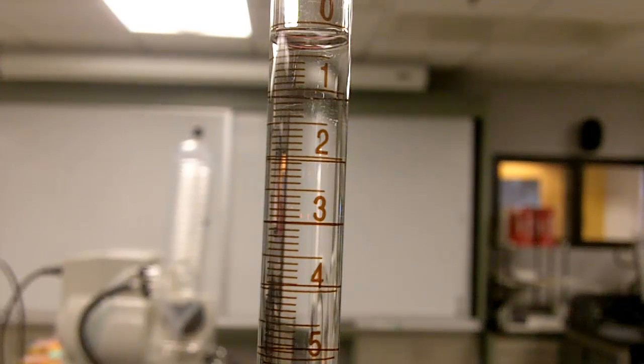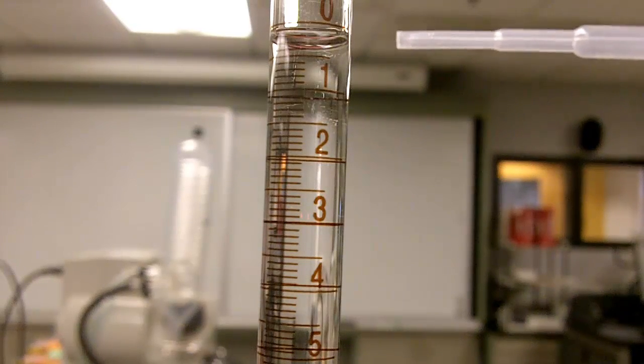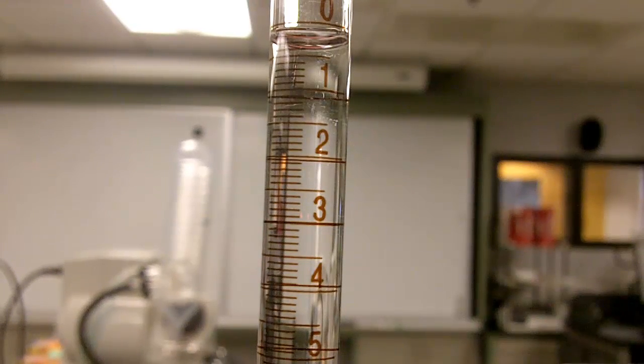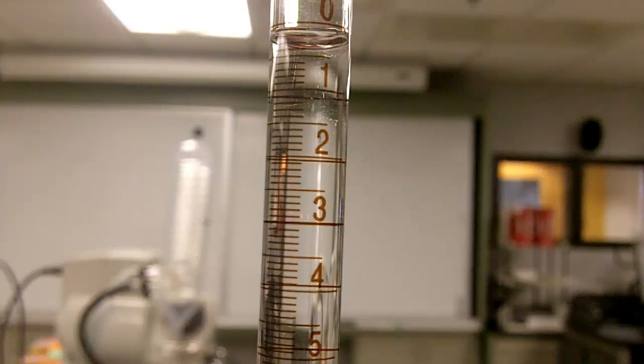Now the thing to remember is that a burette is reverse graduated, which means that the zero is at the top and the numbers get larger as you go down. The reason why it is done that way is so that you can subtract the initial number from your final number to find out how much volume has been dispensed.